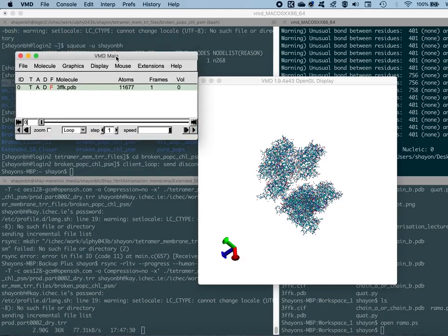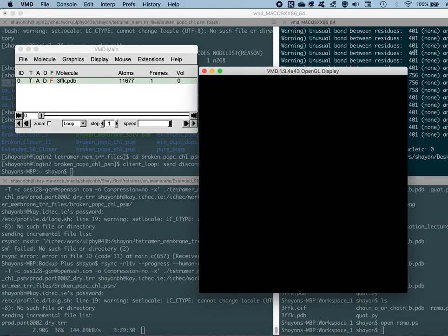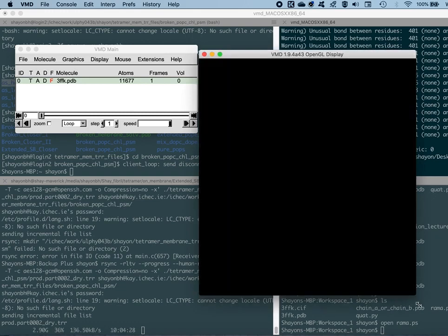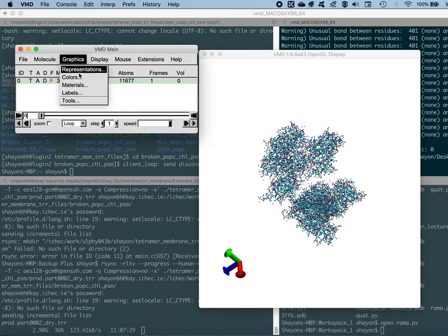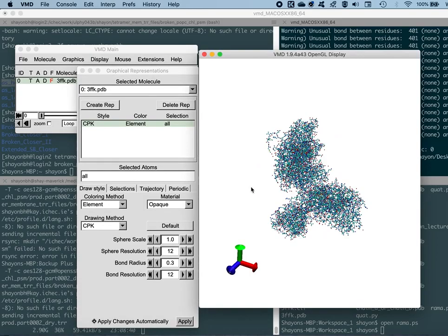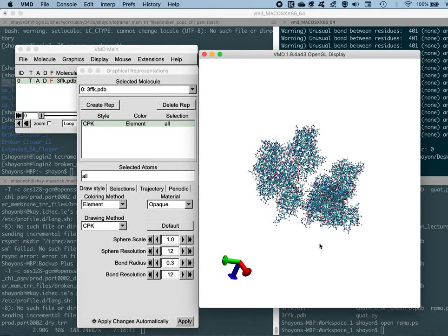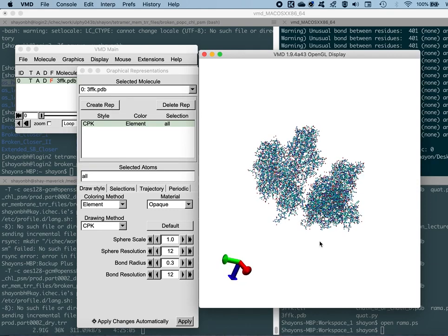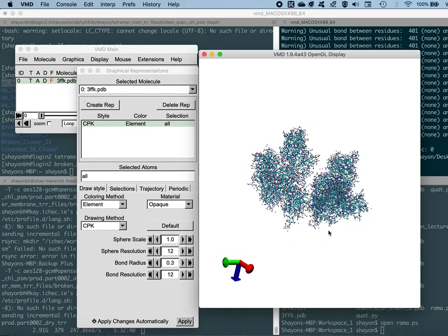All right, so the first thing that we'll do is represent the protein and the other entities like the metals, the water, and the ATP separately. Just like we did before, with the aspartyl tRNA synthetase system. So we go to Graphics again, we go to Representations, and you might be aware that this protein is having 4 chains, which is basically 2 different subunits belonging to a single asymmetric unit. So each of the subunits is actually a heterodimer of gelsolin and the actin protein together.